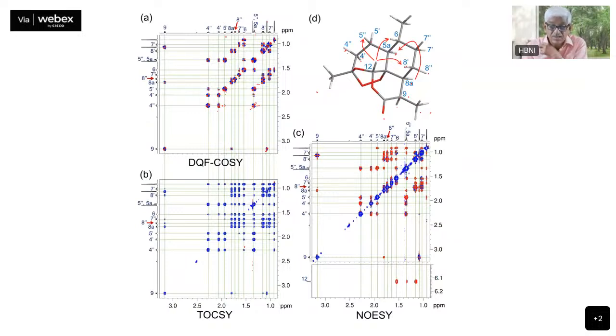This one is 6. Okay. Where is 6? 6 is here. It is far, so therefore it is a relay. Is the relay to the 5A? It is showing to the 5A also, right? This is 5A. So from 4 double prime to 4 prime, then there is a relay from here to here, here to here, here to here. So there is a relay.